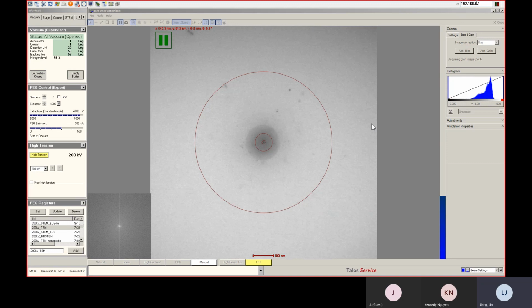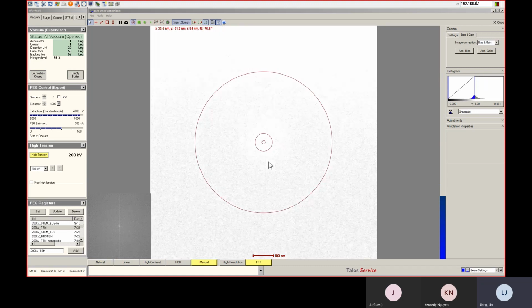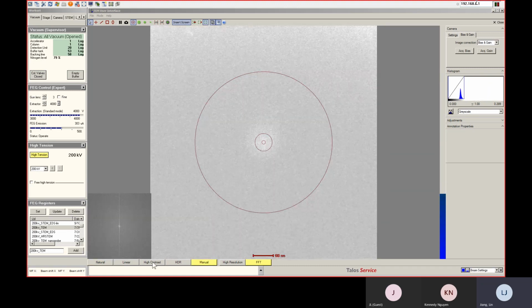And it's going to acquire the gain reference, and then apply the gain reference to imaging. Make sure you're on the recon region. Okay, now you see your fluid cam is pretty good. You don't have any bright spot or dark spot in your fluid cam.